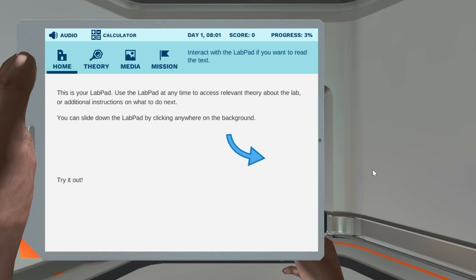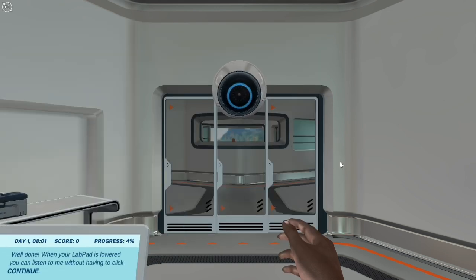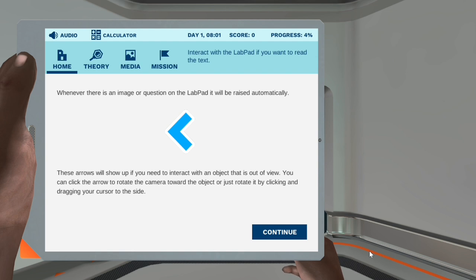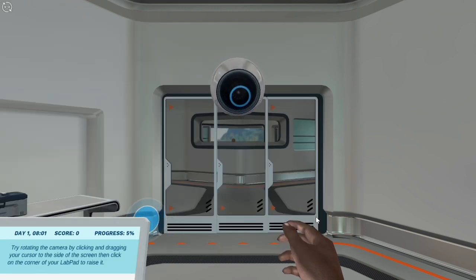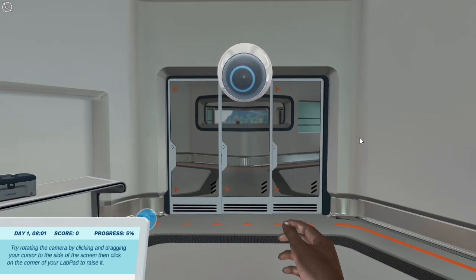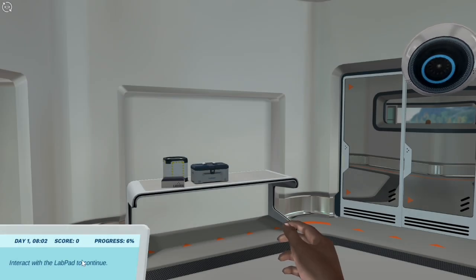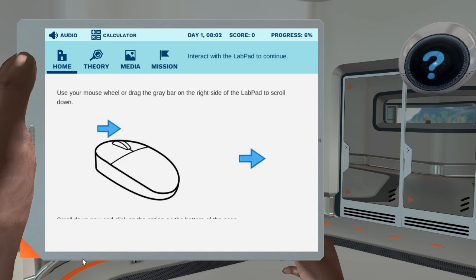You can slide down the lab pad by clicking anywhere on the background. Try it out. Well done! When your lab pad is lowered, you can listen to me without having to click continue. Whenever there is an image or question on the lab pad, it will be raised automatically. These arrows will show up if you need to interact with an object that is out of view. You can click the arrow to rotate the camera toward the object, or just rotate it by clicking and dragging your cursor to the side. Try rotating the camera by clicking and dragging your cursor to the side of the screen, then click on the corner of your lab pad to raise it. The lab pad will guide you through the virtual lab and store all the information you collect while playing.